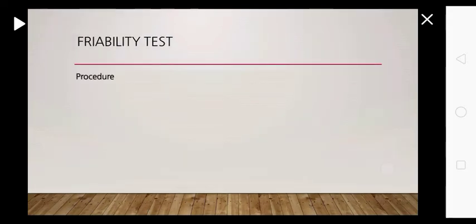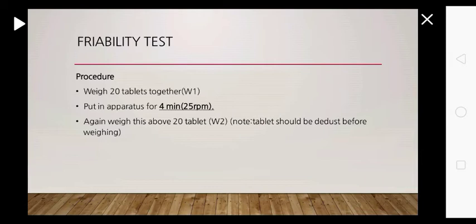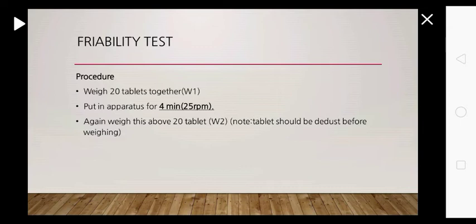Procedure: Weigh 20 tablets together and name as W1. Put it in apparatus for 4 minutes at 25 RPM, and again weigh these 20 tablets and name as W2. Note that the tablets should be dedusted before weighing.